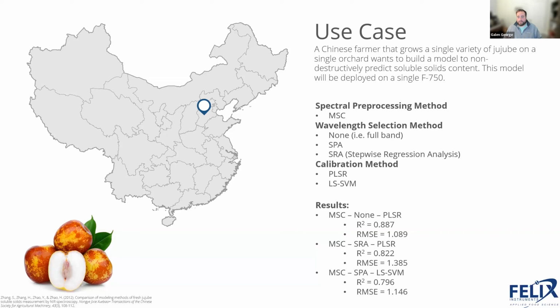You want to actually evaluate the performance. Part of what you want to look at is all these different types of methodologies. That's great, and you can absolutely do that. But for everyone else that's wanting to use these in practice in their commercial operations, this is maybe not the most practical way to go about doing things. Simplicity is oftentimes just as good as far as selecting these methods. Simplicity is just as good as doing the super exhausting work of checking out every single possible permutation and combination of these methods.